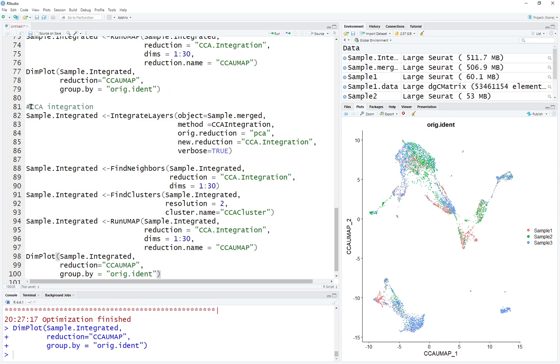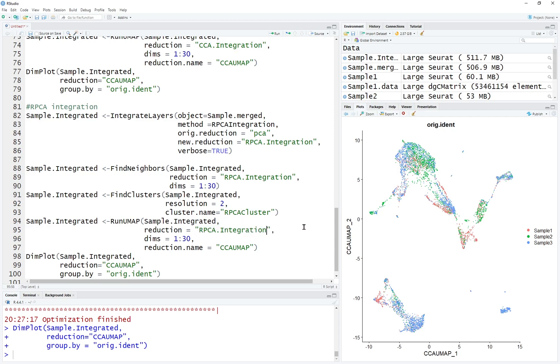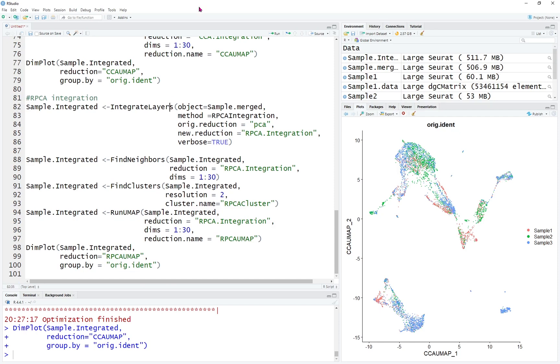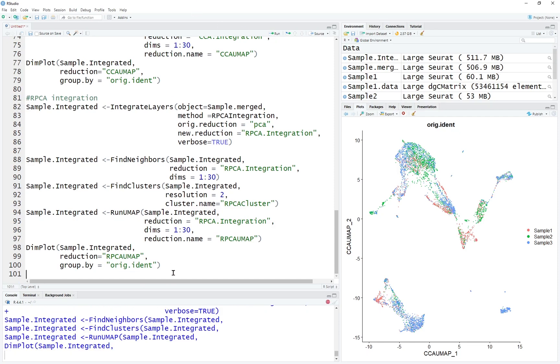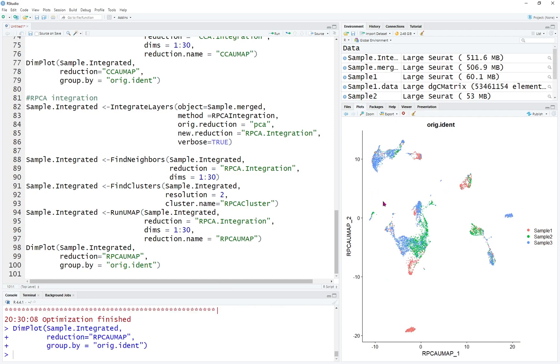The third method is called RPCA integration — RPCAIntegration. The method is changed to RPCAIntegration; we rename the new reduction to RPCA, the cluster name to RPCA cluster, and the reduction name to RPCA UMAP. Everything else remains unchanged. We run through all the commands — it also takes some time, but much shorter than the CCA method. This is the result from RPCA integration, which could be a little bit different.